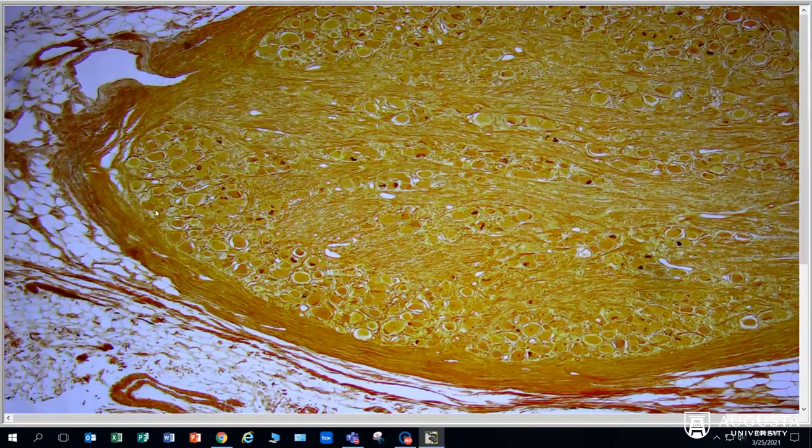So here we see cell bodies all through here, and then pockets in the center. And we can see that round cell body structure. We can also see a series of linear strands that almost resemble axons, and that's because they are. The cell bodies cannot exist alone. They must be connected to an axon. So the axons can enter and leave the dorsal root ganglion.